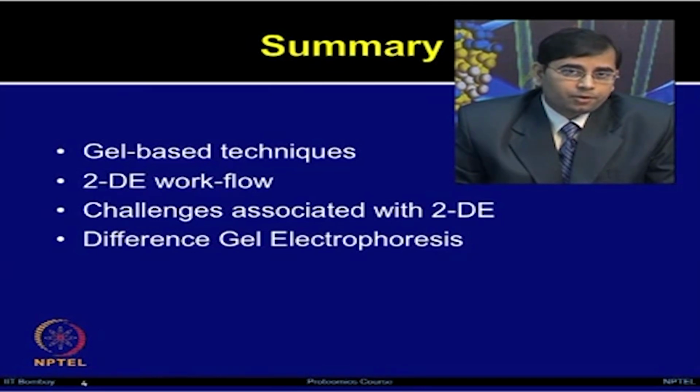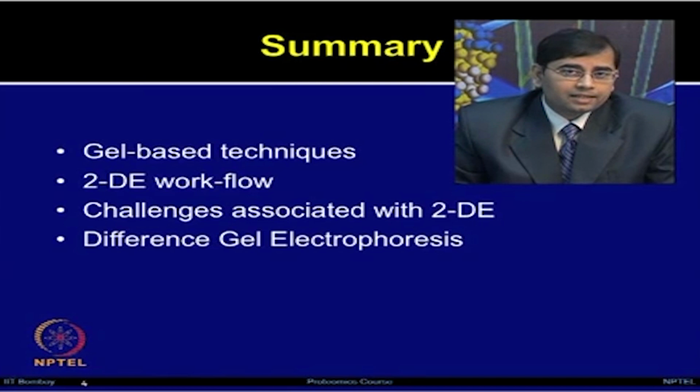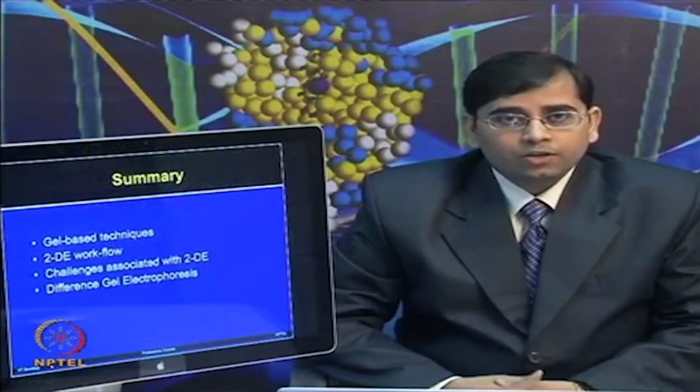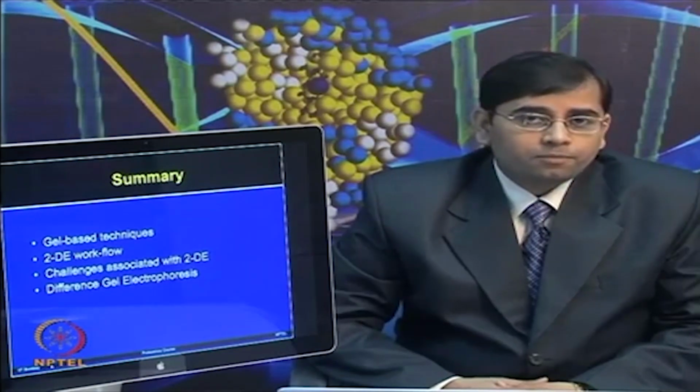Then we discussed different challenges for these methods, and I briefly introduced a few creative ways of performing gel based proteomics, including off-gel fractionation methods, and then we discussed in much more detail difference gel electrophoresis.